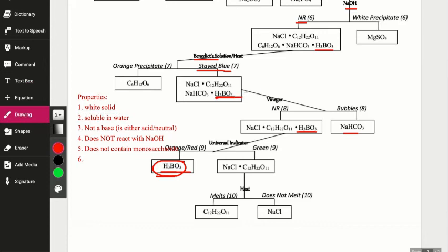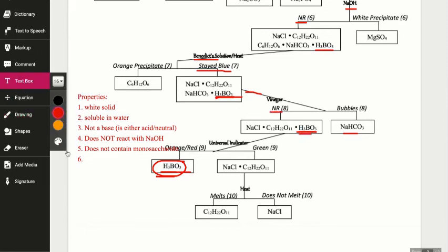It was here. Now we're going to go test it with vinegar. It doesn't bubble. NR, no reaction. It's boring. Doesn't react with vinegar. So it's boring, but that's a chemical property. We gave it an opportunity to react, and it didn't. So it does not react with vinegar.